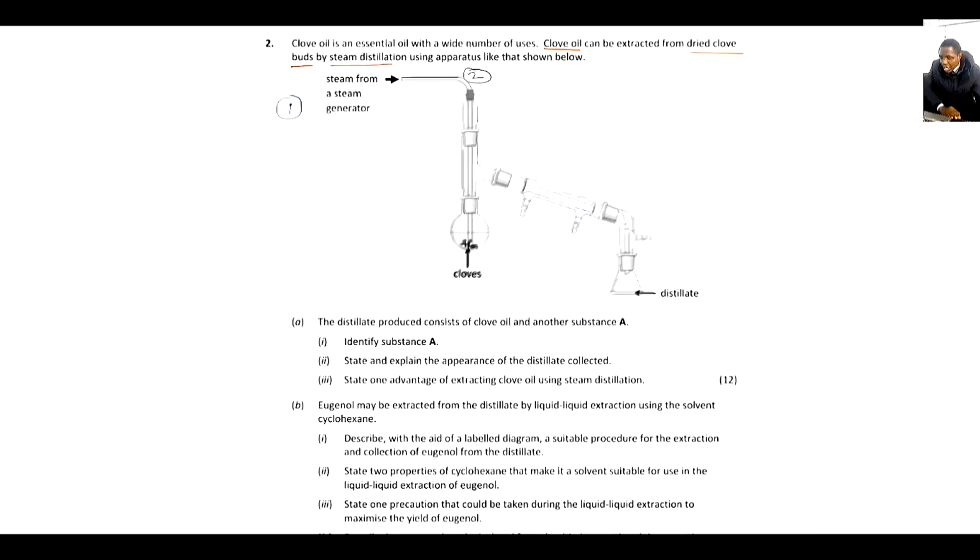We have the one-way adapter that allows the passage of the tubing and also serves as a stopper. Now, I will omit number four because I'm going to use it to explain these functions. Now, number five and number six here. Now, coming back to number four that I omitted.